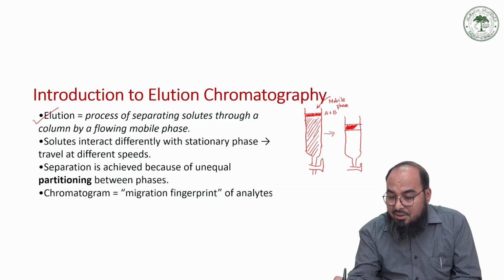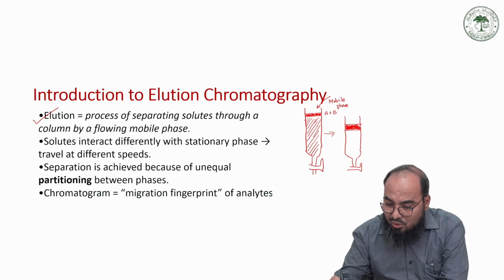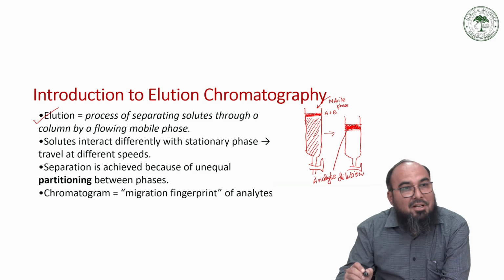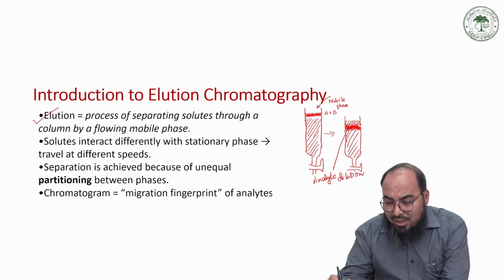This broadening of the band is called analyte dilution. This is a very interesting fact. The band moves a little downward, and this is called analyte dilution.